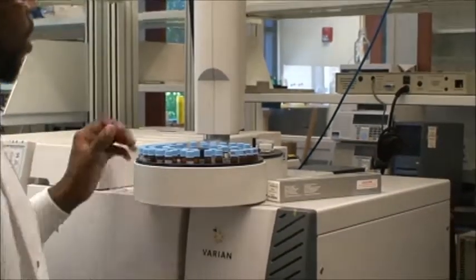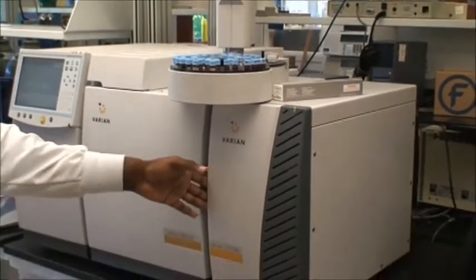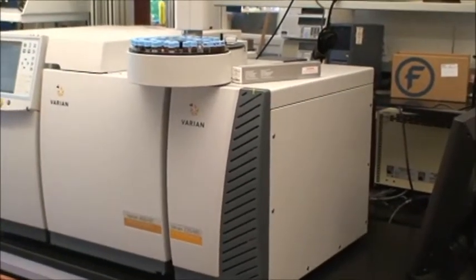Once you inject your sample, it comes to the MS detector, which actually gives you a spectrum.